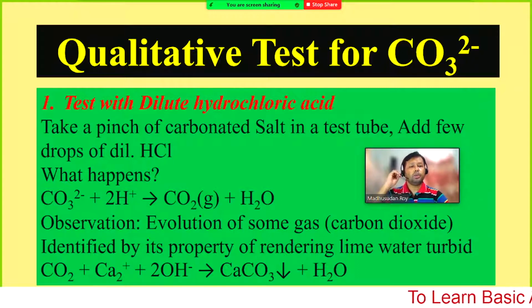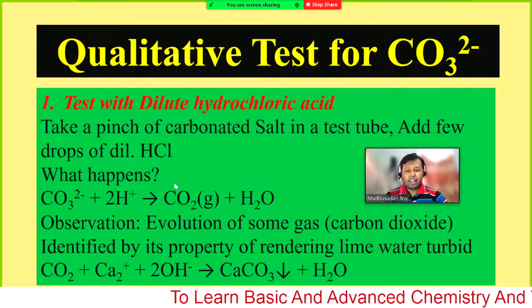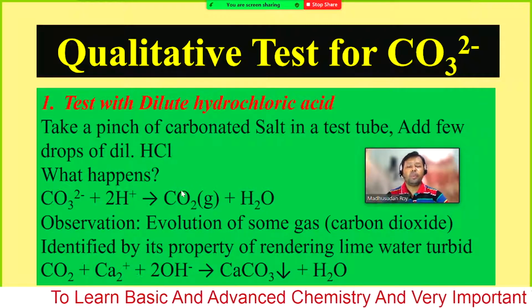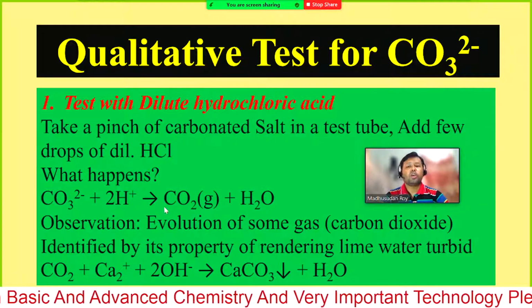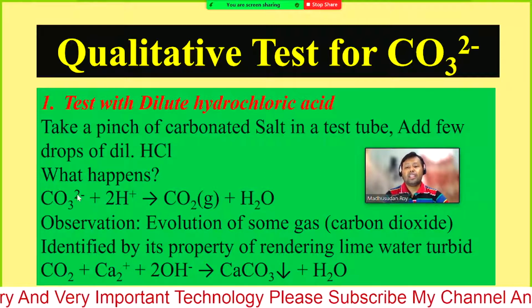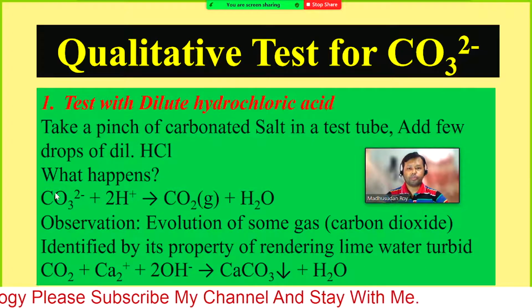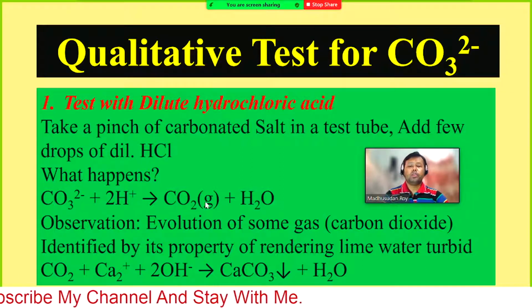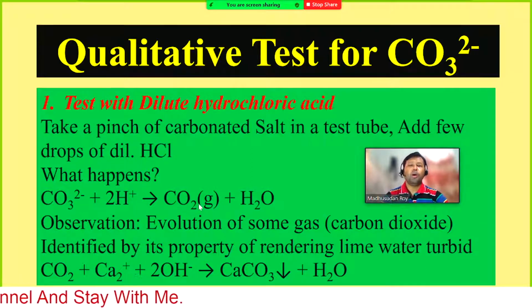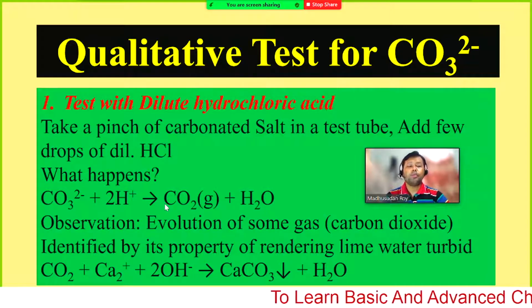To confirm it, you need a further test. As the gas evolves, you need to confirm that this gas is carbon dioxide, so that you can be sure that the sample contains carbonate. In that case, you need to pass the gas, the effervescence we are observing in the test tube, through clear lime water.